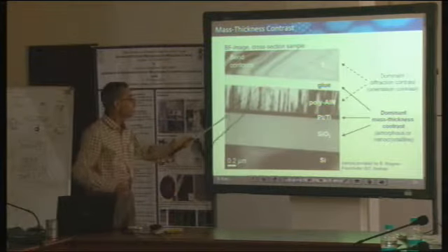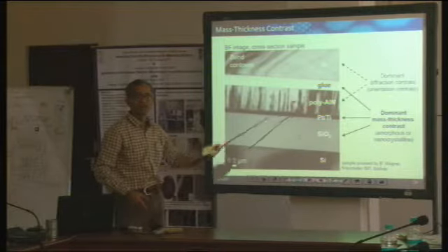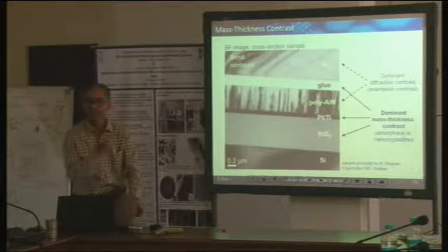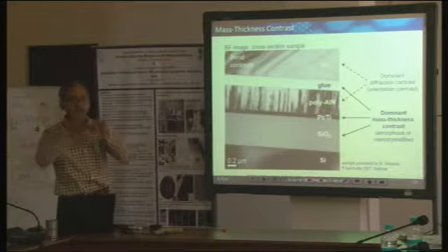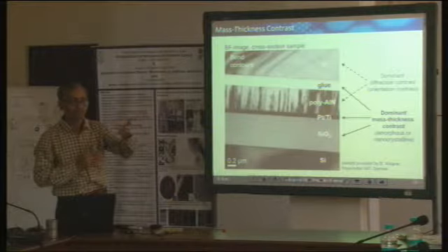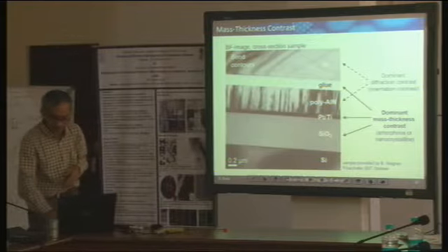Therefore, most of the intensity from this region still manages to remain in the original beam, whereas this part, let's say, is satisfying the diffraction condition, so most of the intensity has gone away. Therefore, when I make a bright field image with the non-scattered part of the beam, I get a dark image corresponding to this area. So in a way, the diffraction contrast mechanism, why the intensity changes, is due to diffraction, but the logic of forming the image and why the contrast comes is the same.